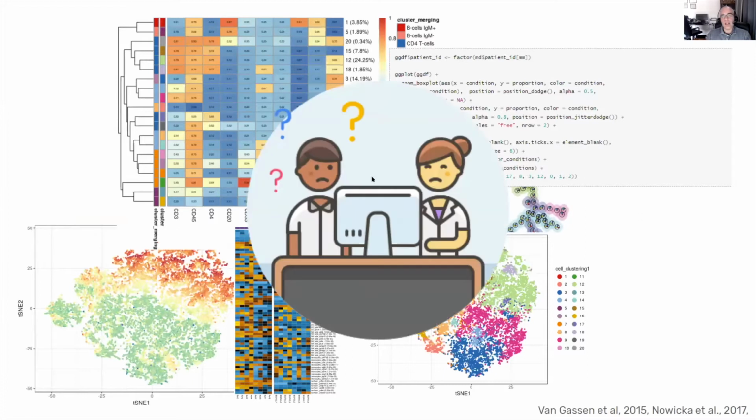And over the past few days, we've seen some excellent tools that help you access all this. Tools such as FlowJo, FCS Express, OMIQ, Cytobank, all of these are fantastic platforms for analyzing your data. However, all of them come with one caveat. You have to know what you're doing, and you have to know how to get there. So all of these tools are excellent Swiss Army knives if you are an expert on the bioinformatics, if you know the algorithms and the parameters.